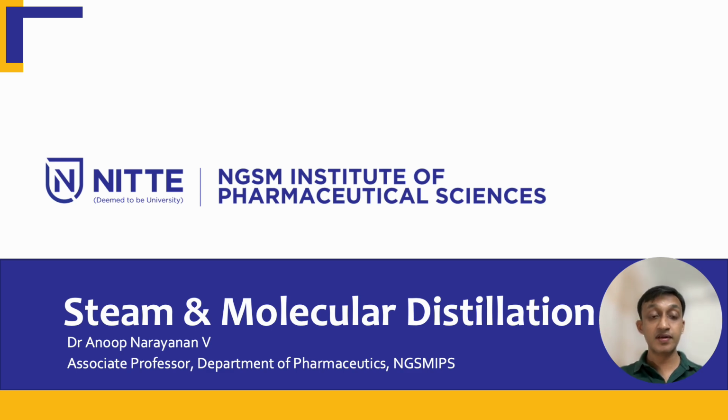We will explore their principles, equipment design, working methodology, applications in pharmaceutical sciences. Let us begin with steam distillation.